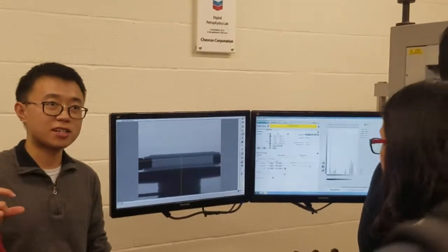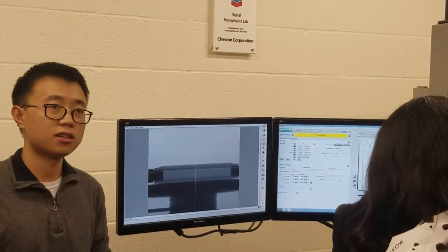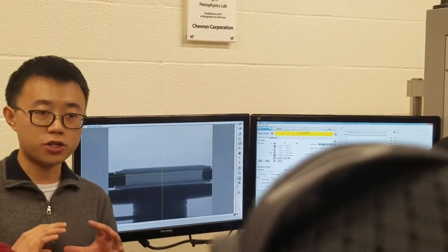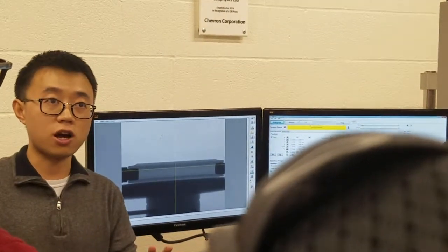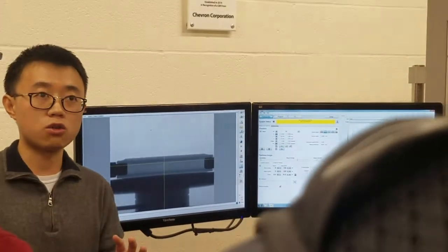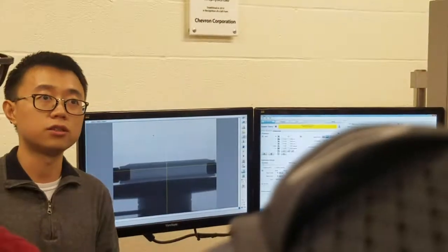That's pretty much like medical CT, right? For microCT, you are projecting a single radiograph, and you are reconstructing many single radiographs for the whole sample at different projection angles.